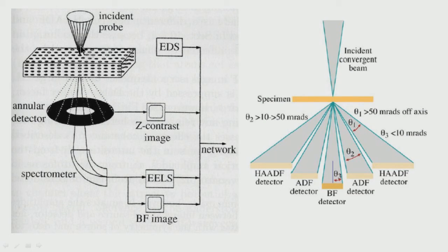Okay. So whatever contrast we are getting, bright field or dark field contrast, arises essentially from each region, the type of atoms which are there, how much they contribute to it. Okay. Because we have made the beam almost as fine as possible, essentially scattering from each of the individual atoms is going to determine what sort of contrast we are going to get.